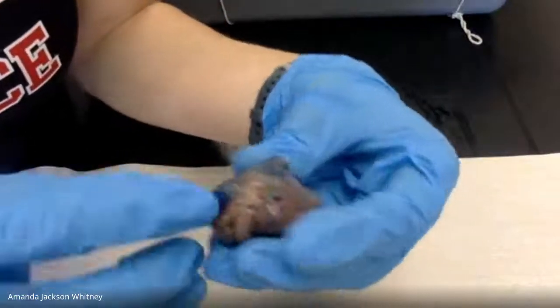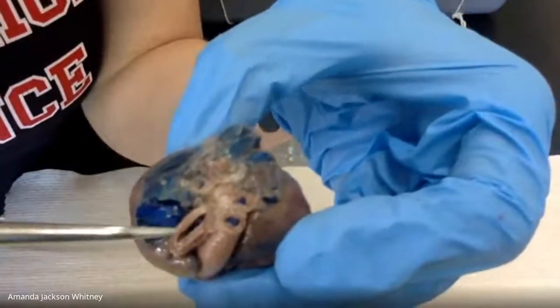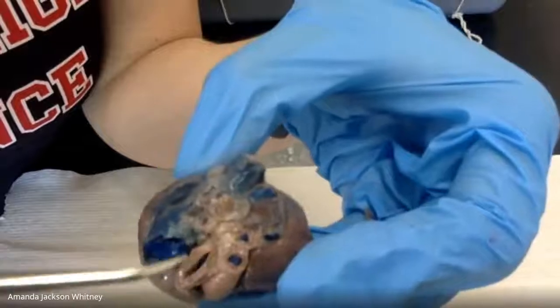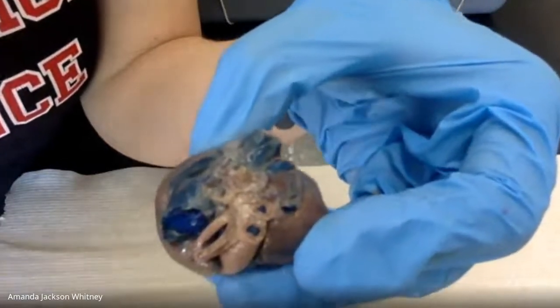Oh boy. I'm trying to take the blue stuff out and it's not working very well. Kind of thinking about the differences between arteries and veins. What would you say, like this here versus this? Any guesses as to which would be a main artery and which would be a main vein?